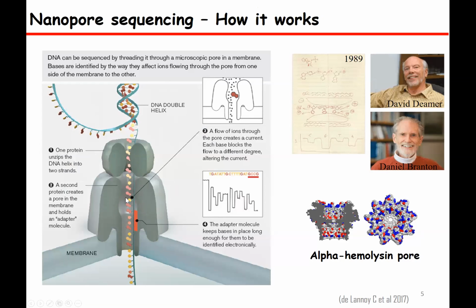So when the DNA passes through, as different molecules have different shapes, it can alter the flow of the ionic current. The current is caused because DNA is negatively charged. When the DNA enters this nanopore, the current is altered so that you are able to see that alteration. Then you capture those alterations as a graph. This is called a squiggle graph. This is then decoded, or base called, to nucleotide bases.